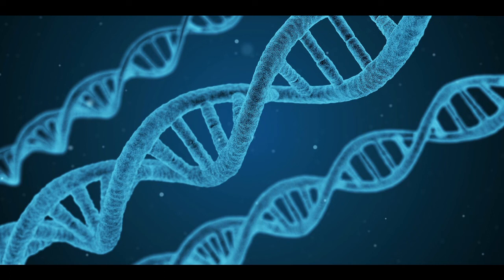So when we plug that information into GenBank and then get a readout with a list of close matches, just to be clear, that's just close matches for that small ITS segment that we looked at. It's a little unclear to me exactly what is important about the ITS region that's being sliced out of the full genome.